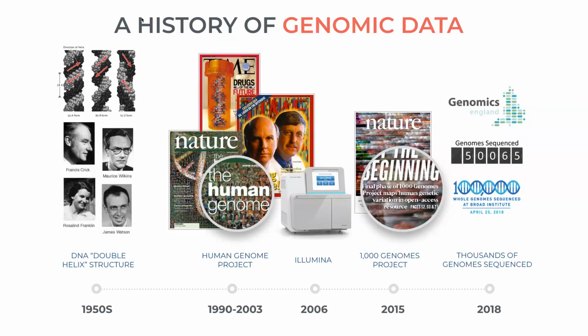So today we want to talk a little bit more about what that technology really does, how do we get that sequencing data, and then we want to talk about how to address the preparation techniques that next generation sequencing uses to produce the data, as well as how to map on these different genomes that are available to us in different repositories like NCBI.